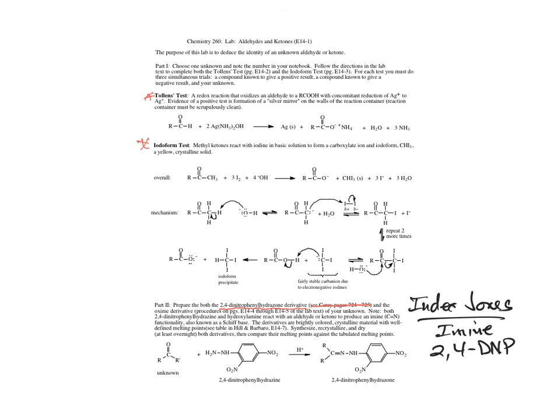So this is another layout of the mechanism based on Dr. Stickney's previous notes that can help you prepare your pre-lab. These reactions are very straightforward. They're going to be done in small quantities in test tubes. We're not going to need our complex synthetic glassware for these. These are just basic chemical tests. So I hope this will help you put together your pre-lab.